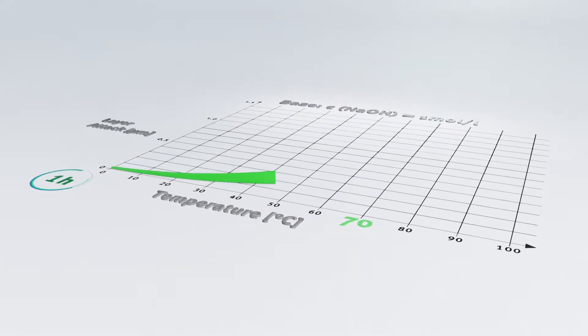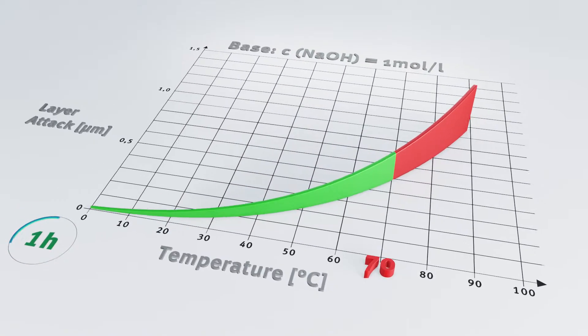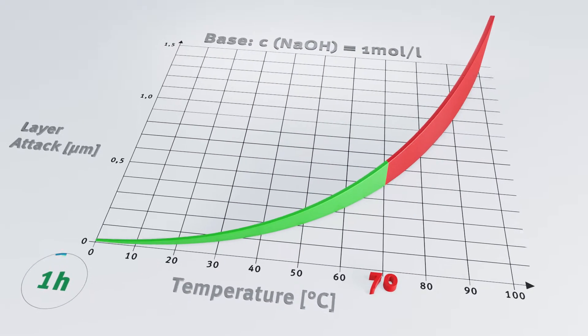This figure shows glass corrosion tendency as a function of temperature in interaction with time and alkalinity.